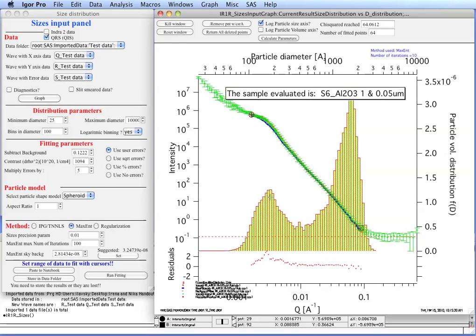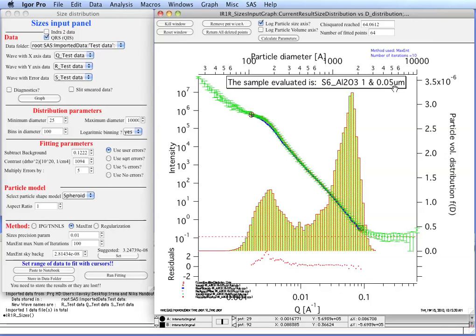And you can see that actually now you don't see anything smaller. You see one peak here which represents the smaller powder which we put in the system, and then this here which represents the large powder we put in the system. Now I told you that the sizes were 1 micron and 0.05 micron. But you can see that probably those powders are much finer. The fine stuff is between 10 and 20 nanometers instead of 50 nanometers as the manufacturer indicated. And the 1 micron particles are between 100 nanometers and maybe 200-250 nanometers. There's really not much left at higher sizes. Now, there is this low-Q power-law slope which may represent the larger particles or some kind of agglomerates.